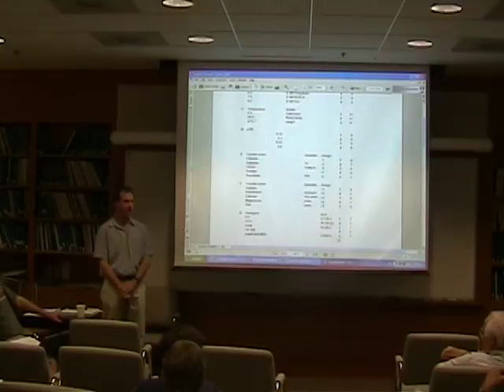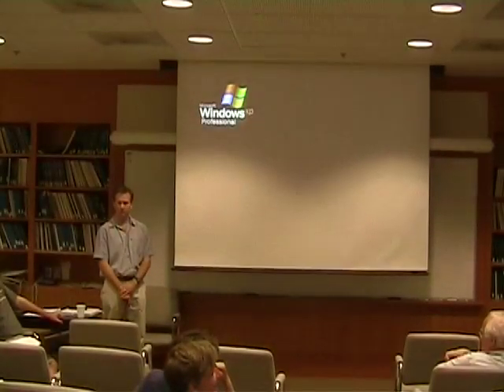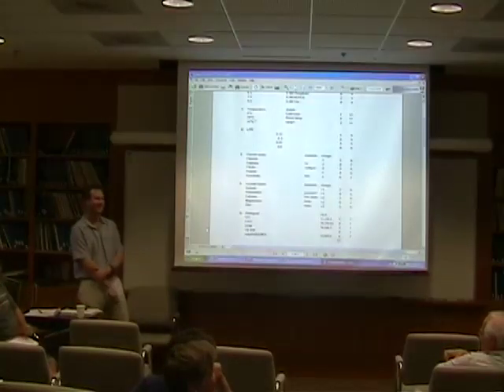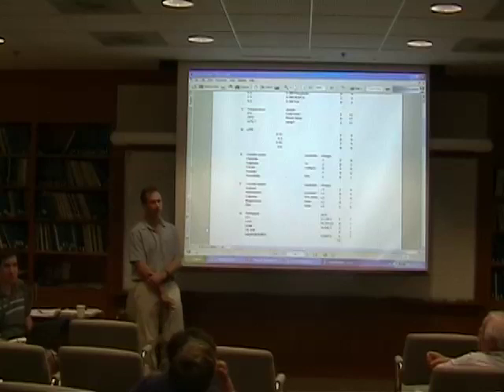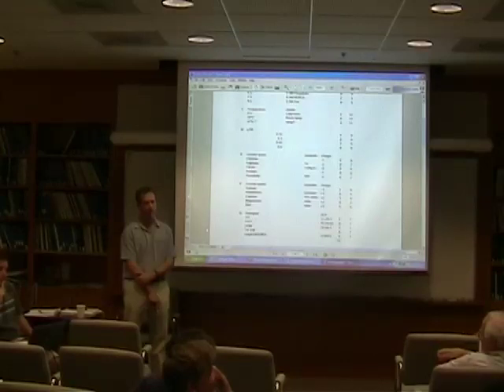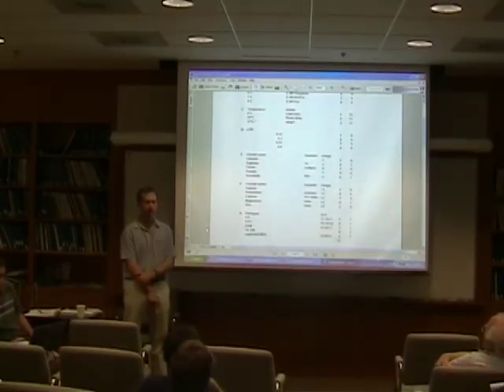Right? So does that sound like a good idea? So should I try this method? David tried it, David Porsche, with a negative success actually. We don't know why it worked and why it did not work. I made a step gradient actually, and we came only to the conclusion probably that there is some protein that gets enclosed in vesicles, and that it's then still floating out with the membranes or whatever. So we did not have consensus for that. It was David and me. We did a lot of experiments with that, and it did not work very well. But it might be different for other people.